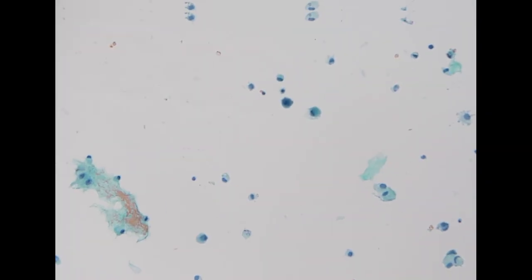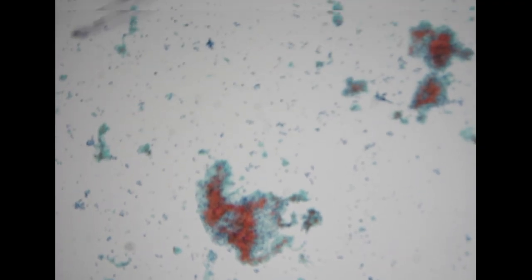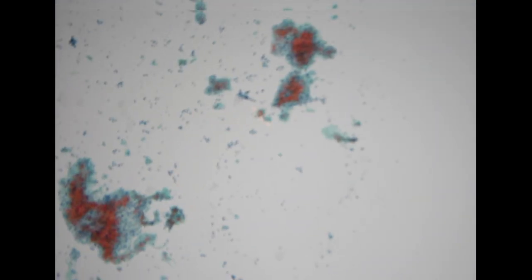So next specimen is coming from a very young 28-year-old female. She came to our emergency department with pleural effusion. In this younger age, we don't expect that we will see metastatic cancer. However, just on low power, we already appreciate that it does show some cells with much bigger nuclei compared to the background inflammatory cells, as well as hyperchromasia. So it is very dark staining just under the low power.